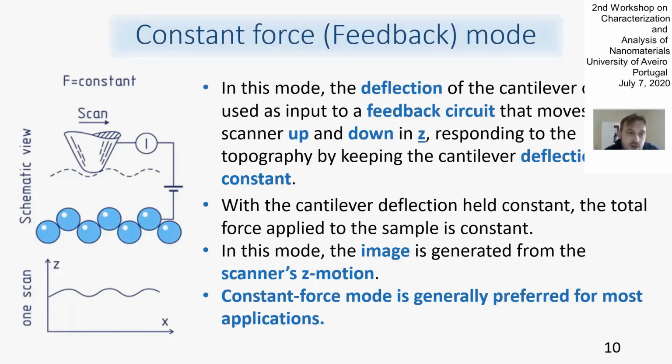So it means that we move the tip across the surface, and when the force between tip and surface increases, we move the tip up a bit. This allows us to keep the deflection signal constant during all the scanning, and the changing of the tip distance from the surface allows us to construct a real relief of the surface.